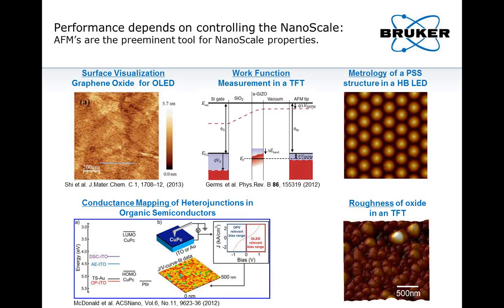And of course, experiments like that, when they deal with heterojunctions, in this case on organic semiconductors, are applicable not only for LEDs but also for organic solar cells.